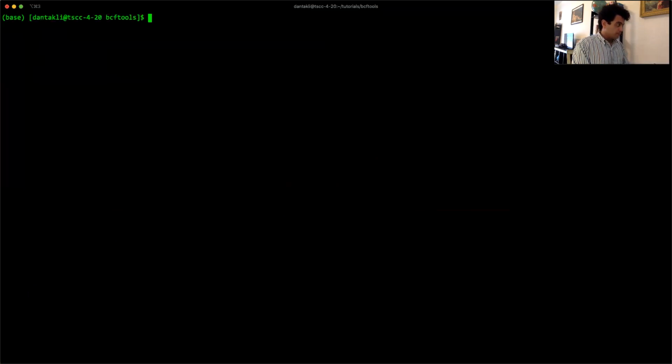So yeah, that's basically it. That's kind of like a whirlwind tour of BCFtools. Highly recommend getting familiar with it, especially if you are considering working with BCF files in genomics and stuff. It's not going to go anywhere. People are going to use BCFs for a while.